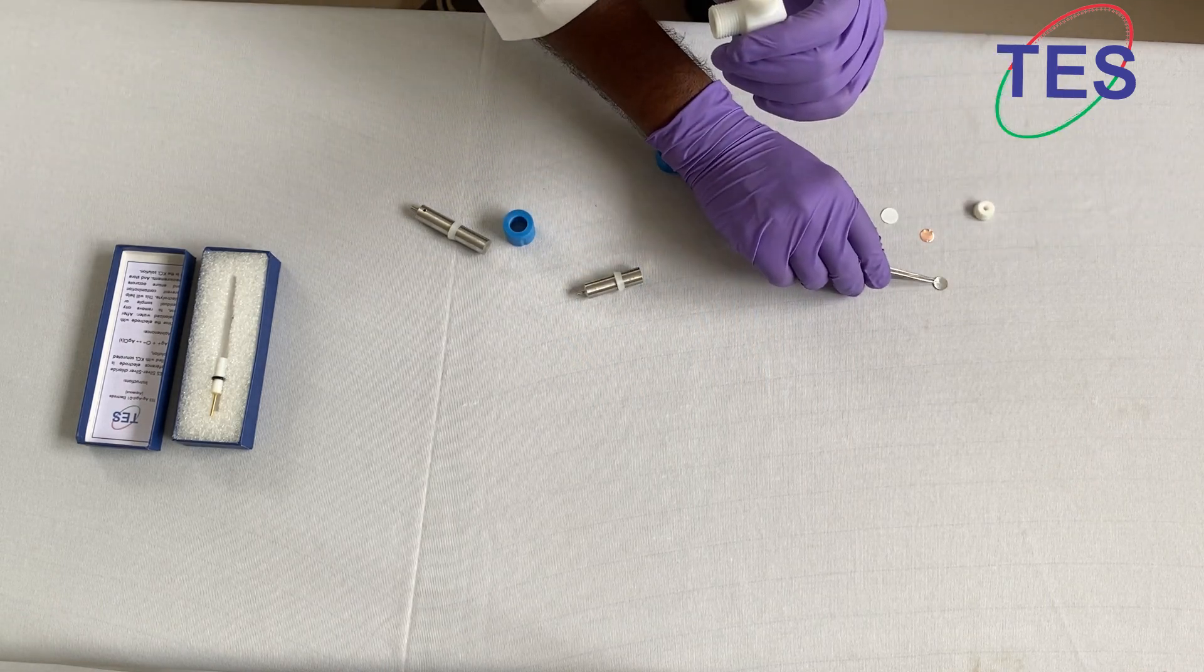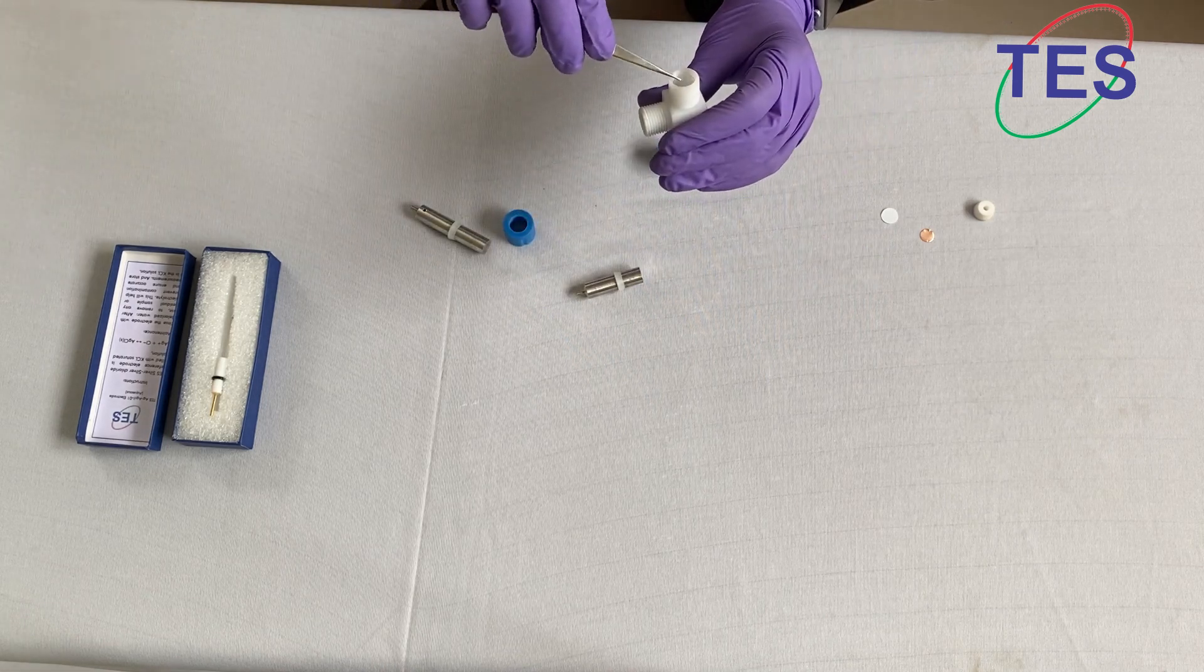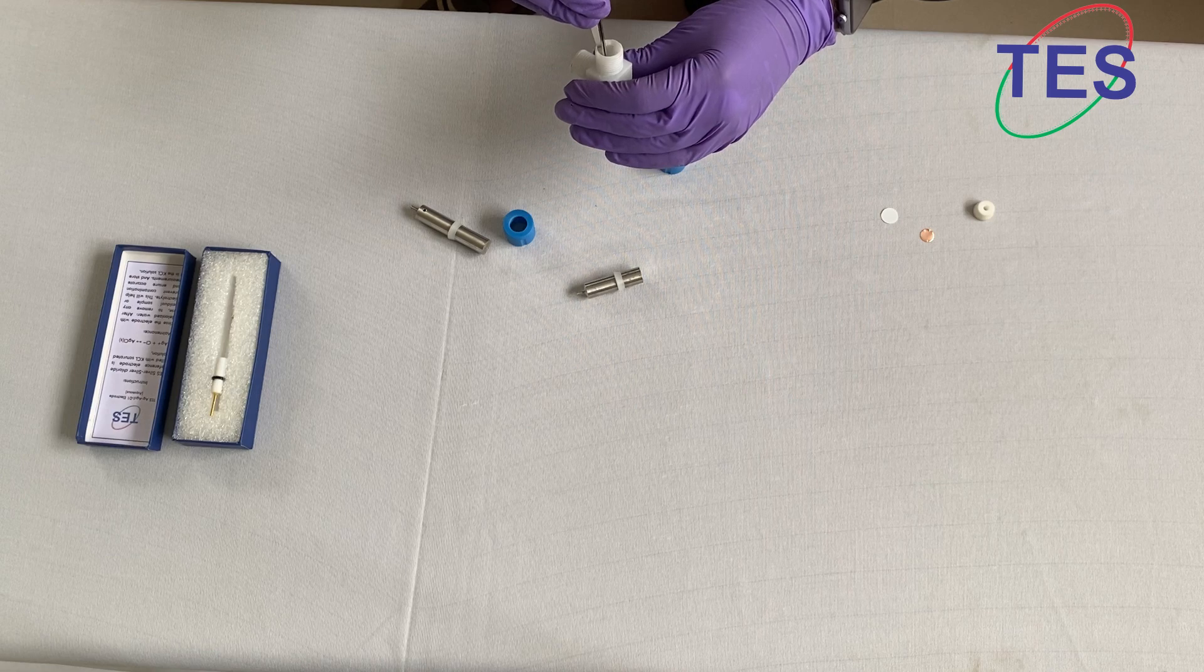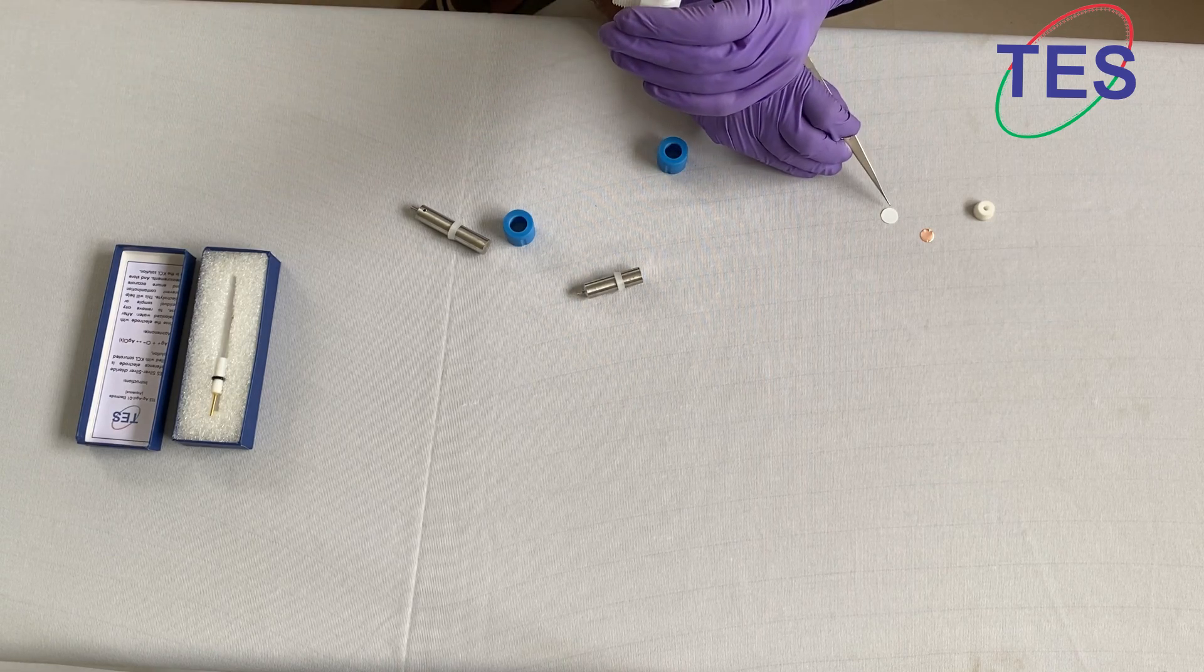After that, you have to take your working electrode material and keep it like this, then your separator.